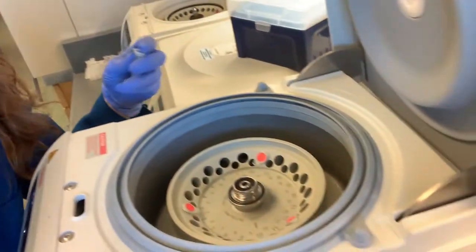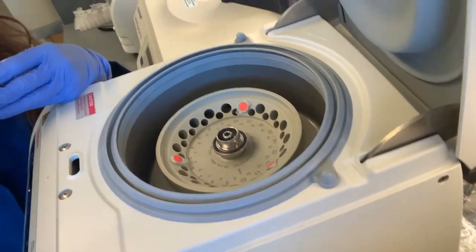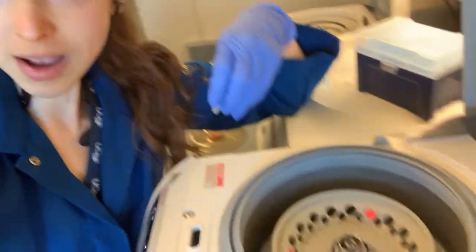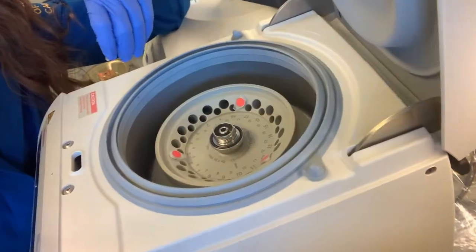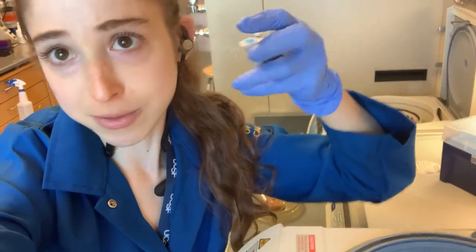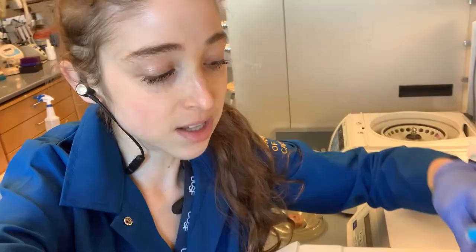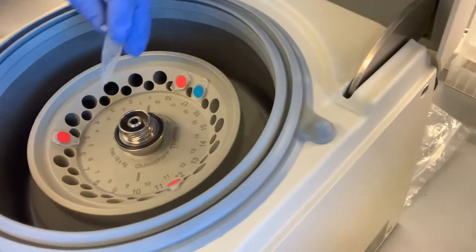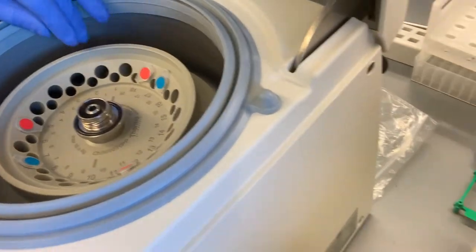What if you have an odd number of tubes? If you have three tubes, or some multiple of three, you can spread them out in thirds and that'll still be balanced. What if you have five? This is where it gets a little weird looking. If you have five, say three are already in there balanced, and we know two tubes across from one another also balance. So you can stick those two tubes across from one another. It looks really funky, but it's actually balanced.